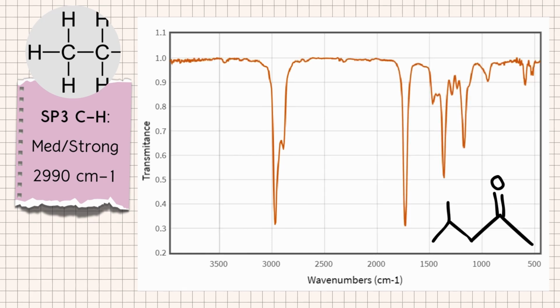Here's the full spectrum. I just reused the ketone one from earlier. It definitely has single-bonded carbons that have hydrogens on them, so it would give this sp3 peak. If you're having trouble seeing those hydrogens, take a look at them all here. And yeah, look, it's got plenty of options. It just needs at least one to give that absorbance.